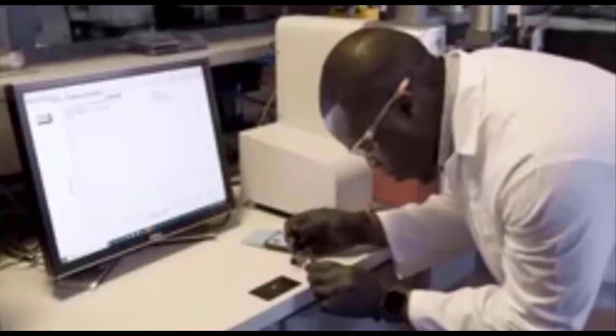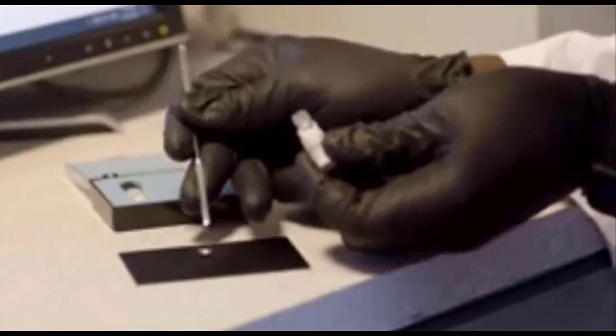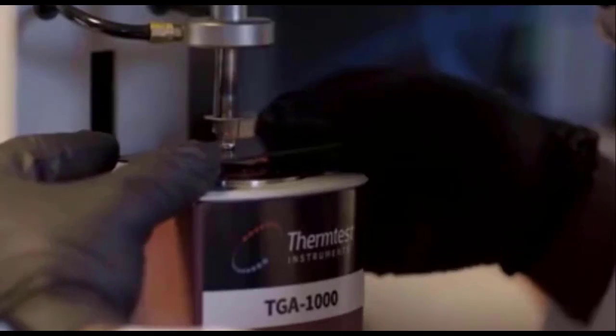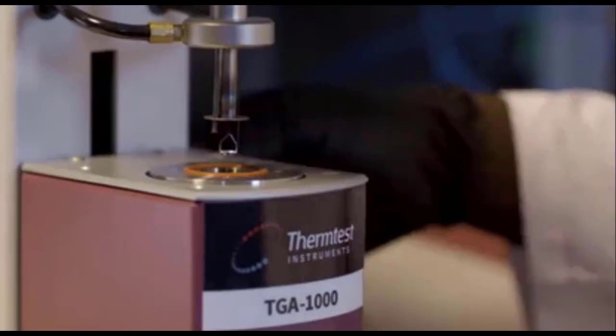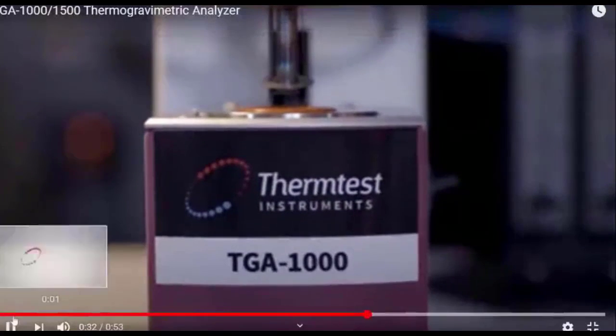I will just show a small video. Thermogravimetric analyzer TGA 1000 and 1500. TGA is a method of thermal analysis in which the mass of a sample is measured over time as a function of temperature change. Results provide information about physical phenomena such as phase transitions, absorption, adsorption, and desorption, as well as chemical phenomena including chemisorption.